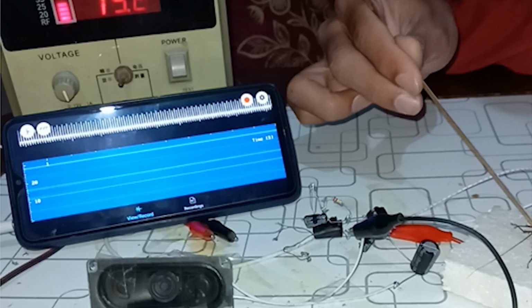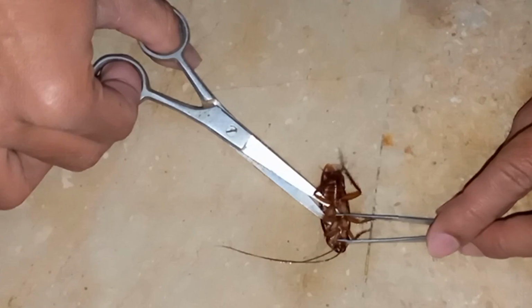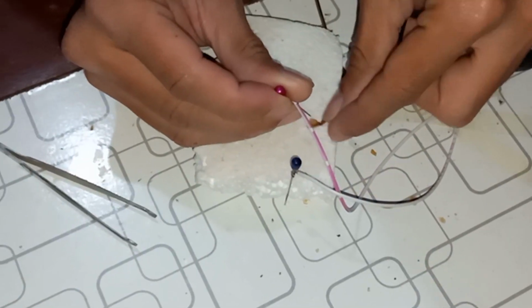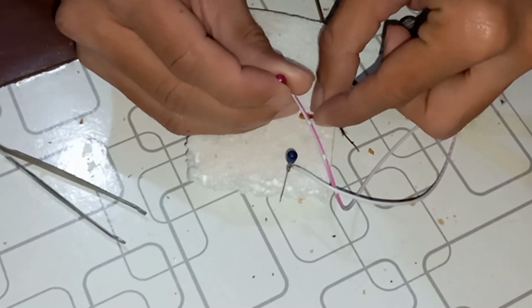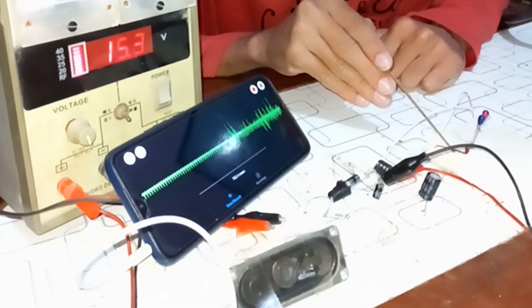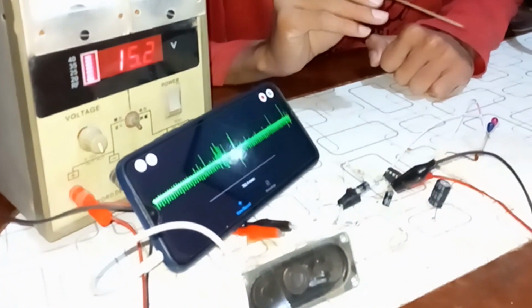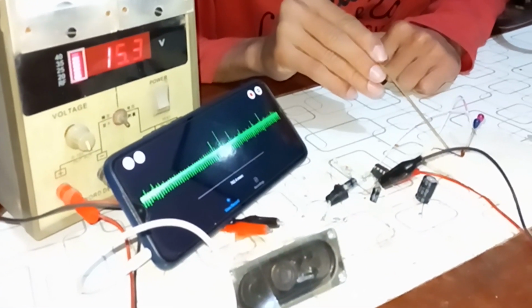To do the experiment, first we need to take a cockroach and then simply carefully cut out one of its legs. Insert two electrodes as shown here and simply turn it on. The popping sound you are hearing is the voice of the neurons which are communicating with each other.